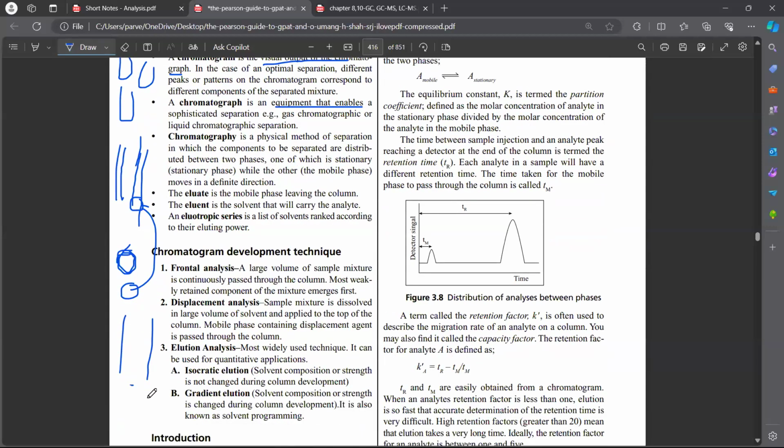The stationary phase is porous in nature, with a specific diameter of opening. Whatever sample analytes are added, if their size is less than the pore diameter, they will enter into the pores of the stationary phase and will be eluted out late. Those having a larger size compared to the pore size of the stationary phase will be eluted out first.